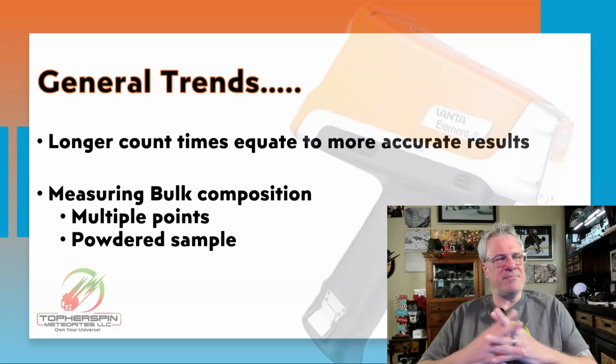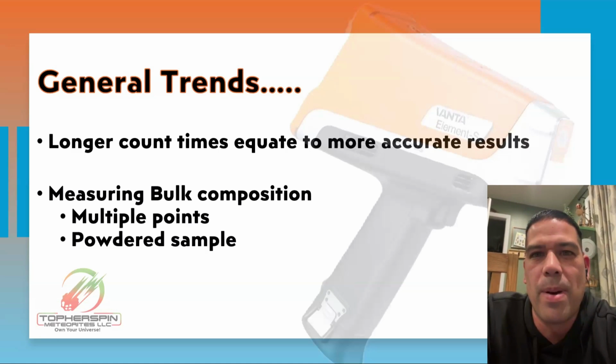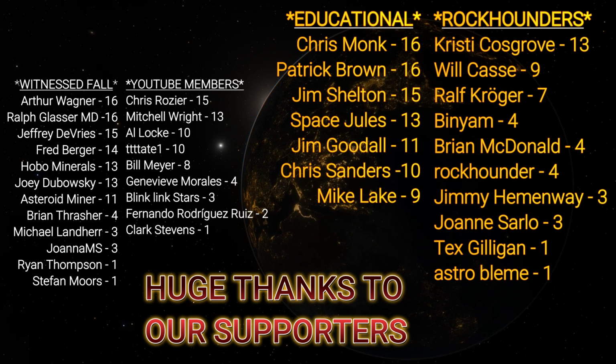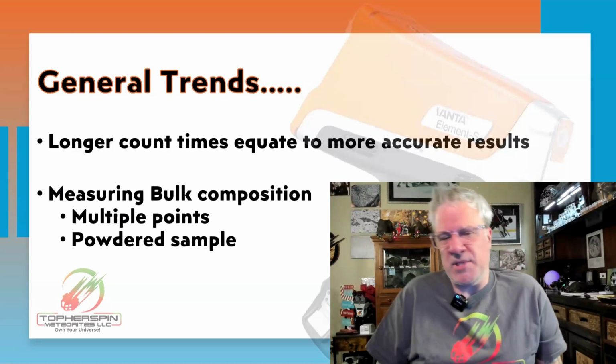How many points are usually collected of data when it's not a pulverized sample? Do you know? I don't know offhand. And again, a lot of that is also the read time, because each machine will give you an option on how long you want to read. Like you heard with Blaine, I'm not even going to take a second shot at this thing. I know using Dustin's machine, it was critical to use the shortest amount of time to get the assessment you wanted, so we weren't putting excess life on the X-ray source. Yeah, because they're expensive machines and we were using it for free.